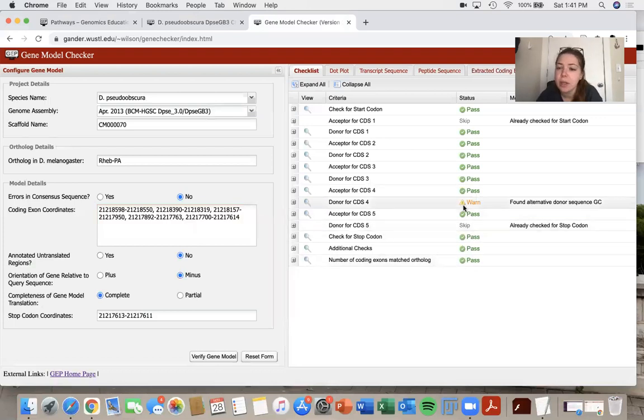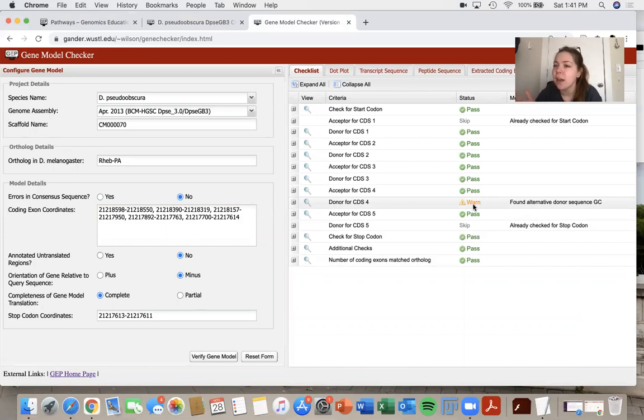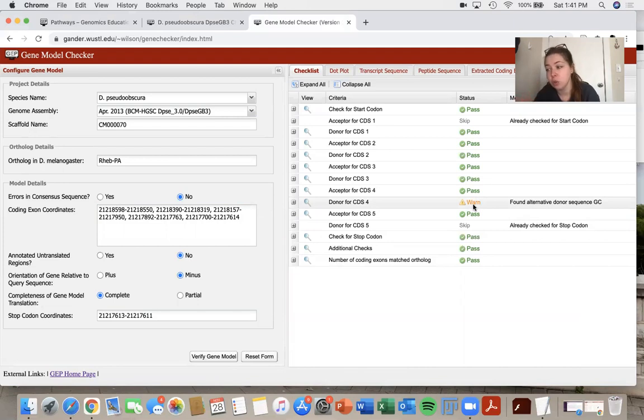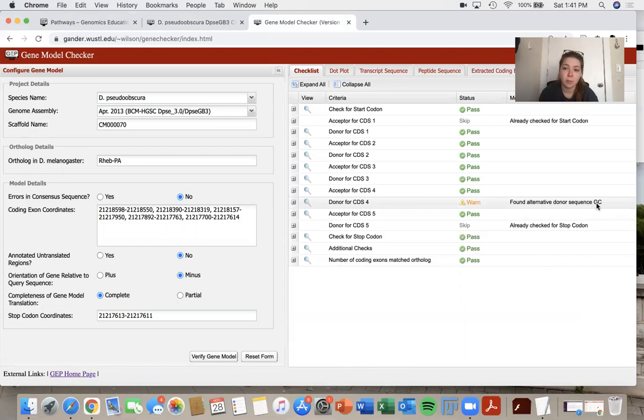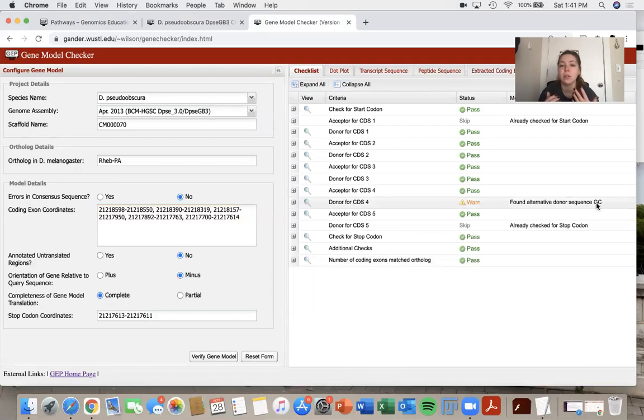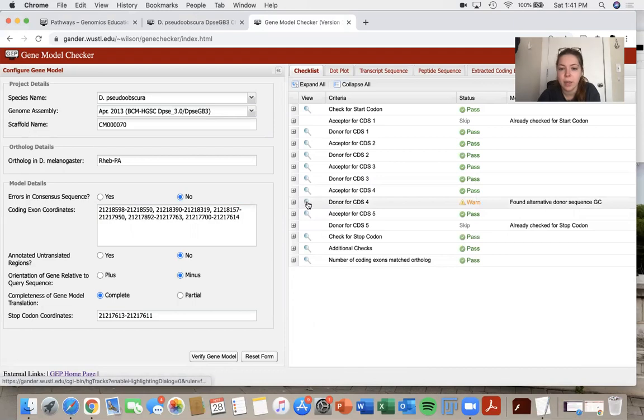So now let's check this warn. So this warn is just kind of like, please check this out. It's not necessarily wrong, but it's something that's a little bit unusual. So for this one, it's telling me that it found an alternative sequence for a donor site that's GC. So we do know that sometimes you can have a splice donor that's a GC versus a GT, but it is more uncommon. So they just want us to really ensure that that's actually what's happening.